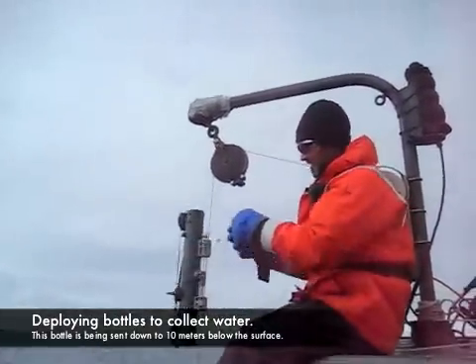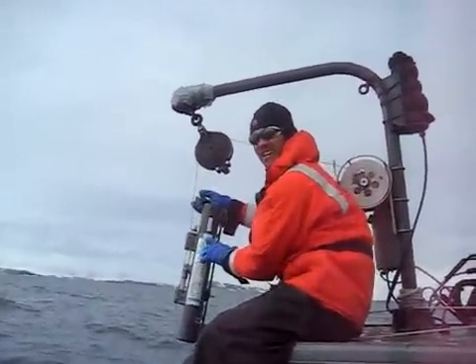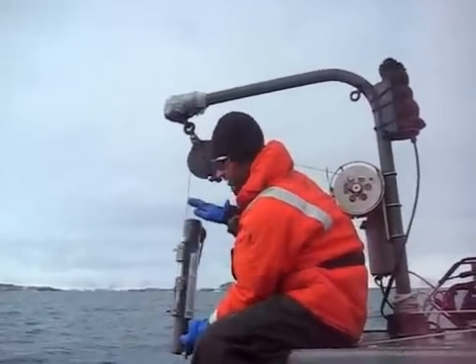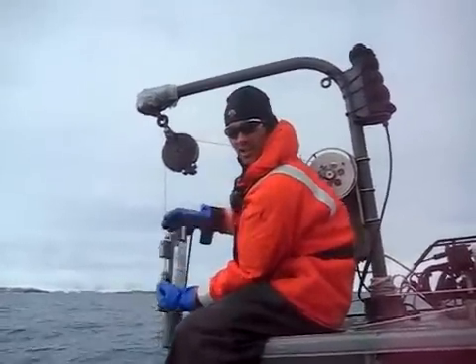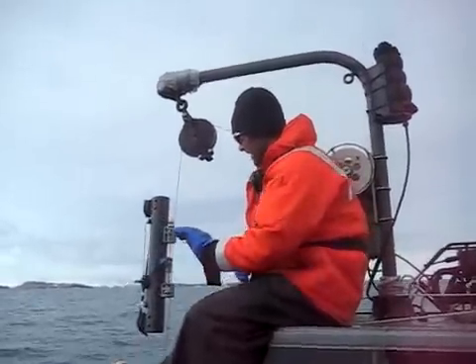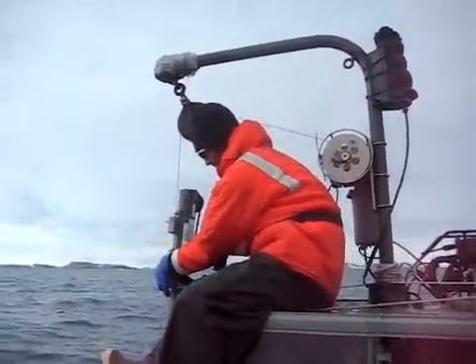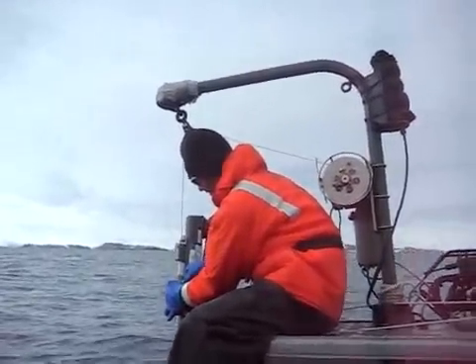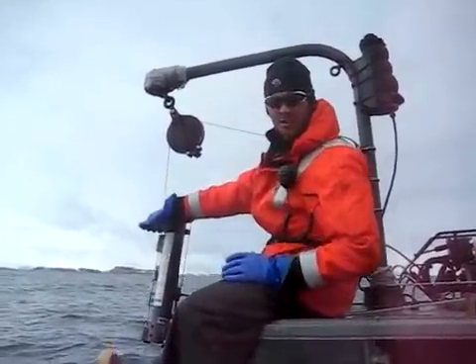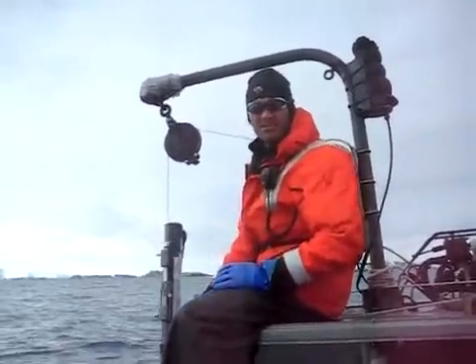The way it works is these are called messengers, and they slide down the cable. They hit this white piece here, which then allows doors on the top and bottom of the bottle to close and trap the water at the depth where the bottle is sitting. They're also rigged up so that once a bottle is triggered, it releases the messenger down the line to the next bottle, so you can get a bunch of bottles at various depths.